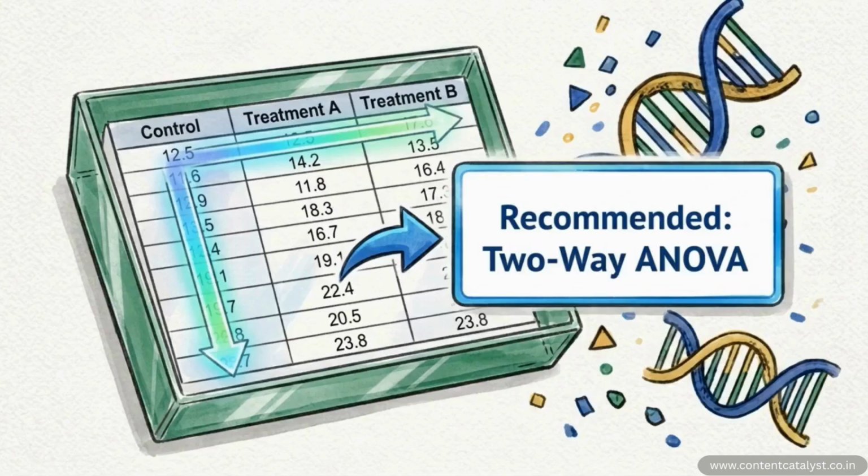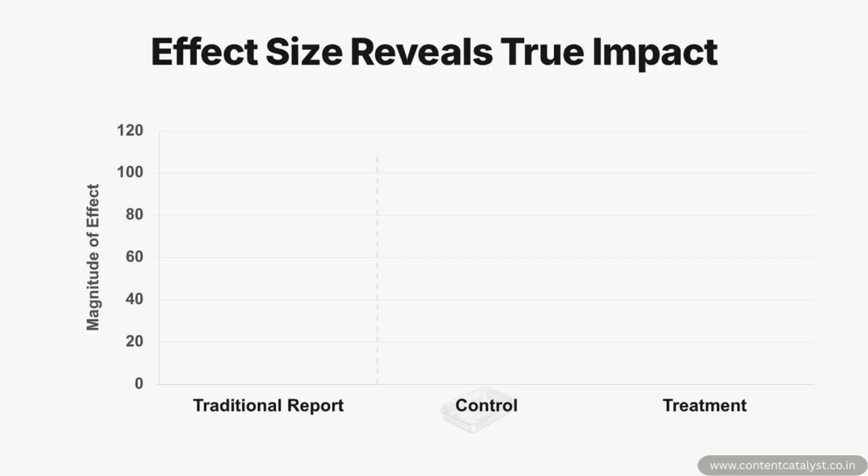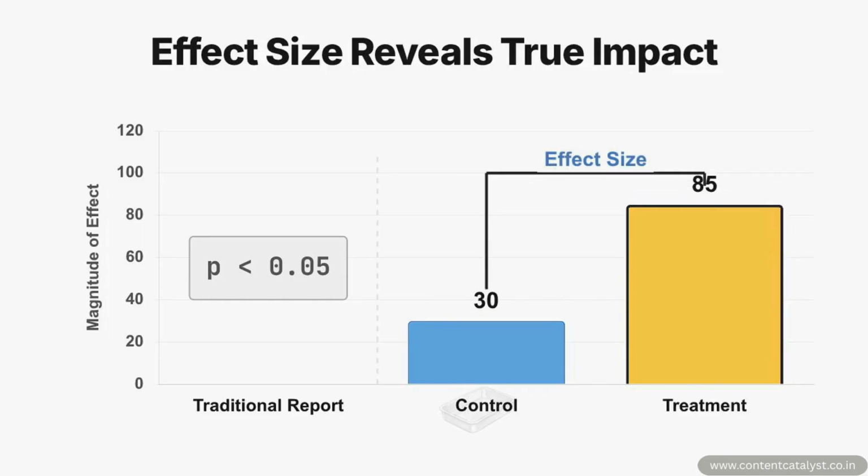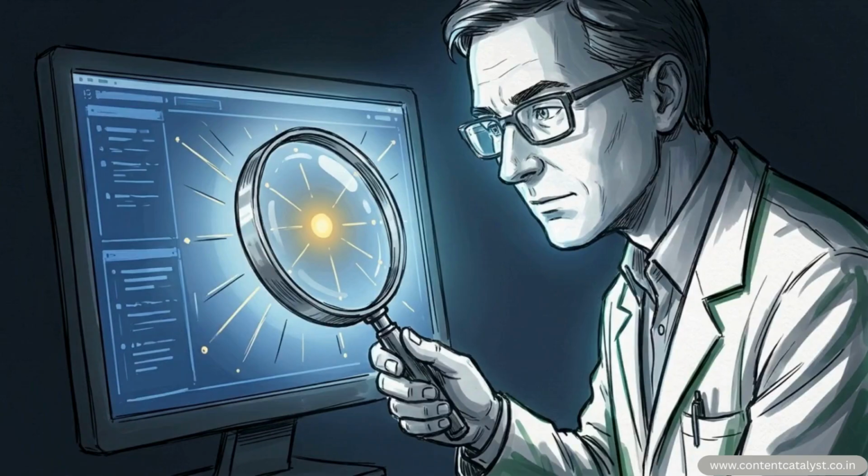One of Prism's strongest arguments for your budget is its built-in statistical guardrails. The software actively guides you. By looking at the characteristics of your dataset, Prism points you toward the appropriate statistical test, helping you avoid running the wrong math on your experiment. It also emphasizes effect size reporting. Instead of just giving you a simple p-value that says whether a result is statistically significant, Prism shows you the actual magnitude of your findings.